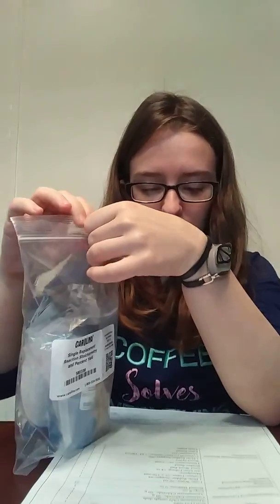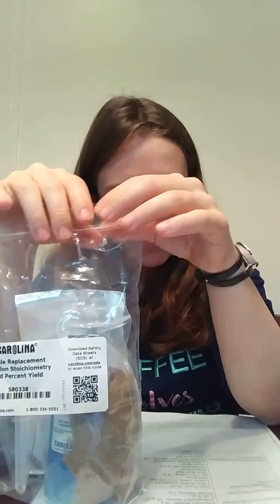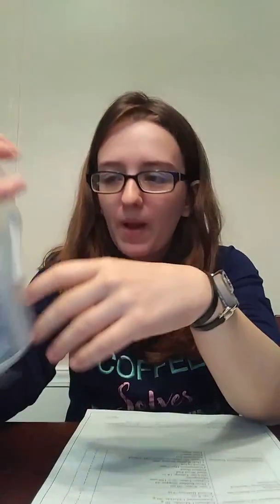The last one is single replacement reaction percent yield. It has copper, copper sulfate solution, aluminum foil, a filter funnel, and filter paper.